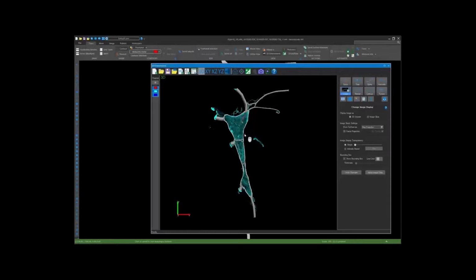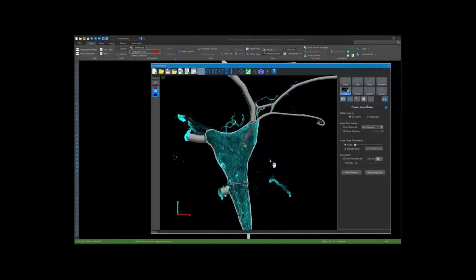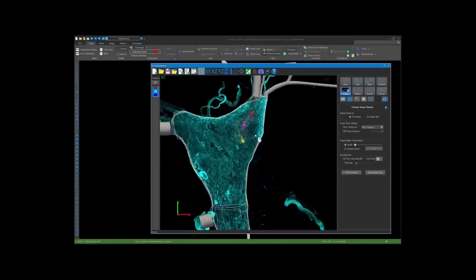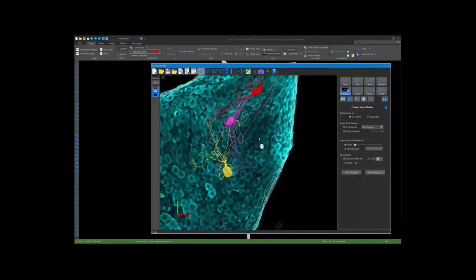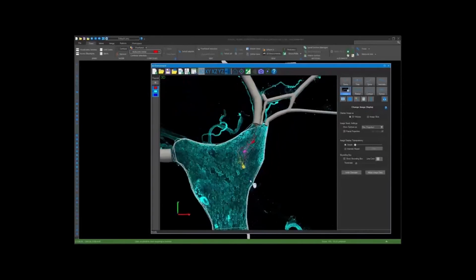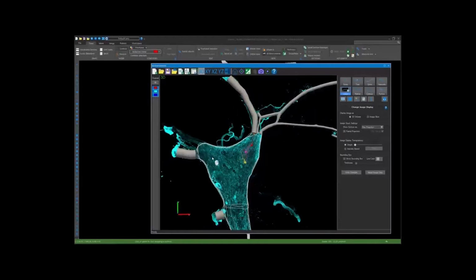We'll hit connect. We're going to now see in the 3D window the 3D image data of the whole stellate with the tracing data as well. Aidan explained how they use contours to contour the body of the stellate and how they trace these high-resolution cells in Neurolucida 360 and then merge them onto the 10x image data. They also traced the nerve bundles that enter and exit the stellate with the tree algorithms.